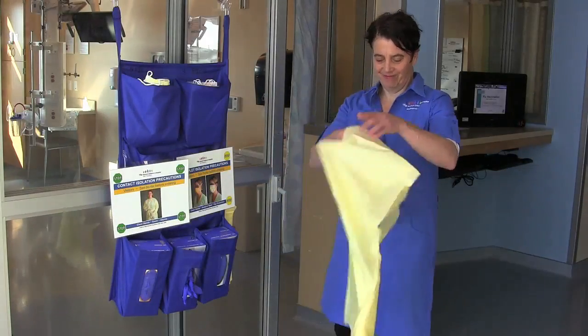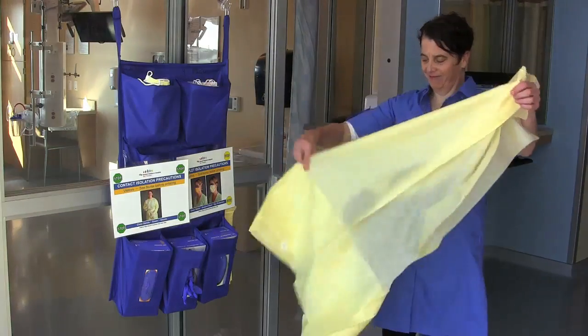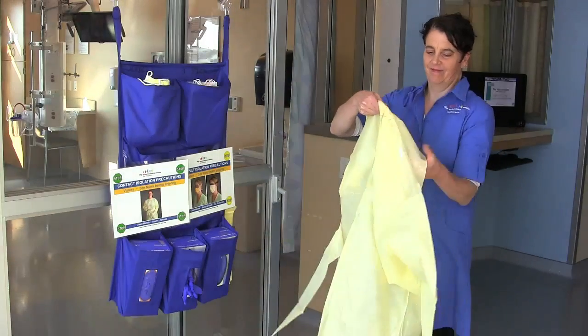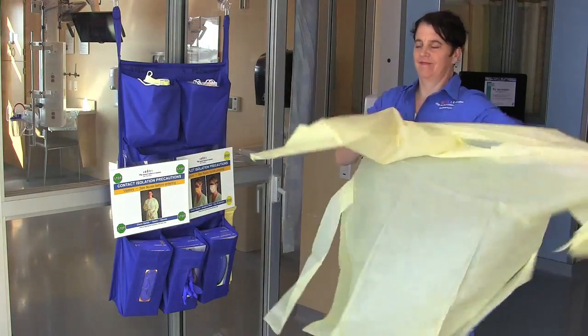Don gown, gloves, mask, and eye protection upon entry into a contact and droplet precautions room. Remove any items from clothing that may prevent PPE from fitting properly.